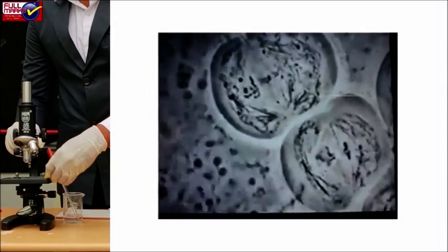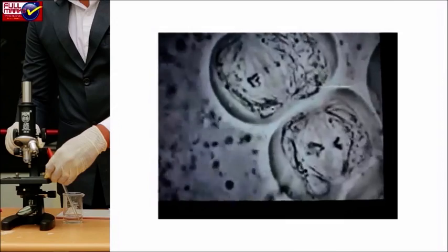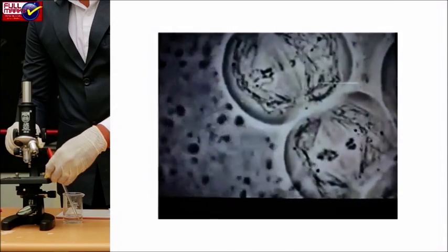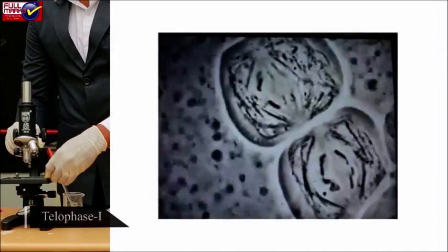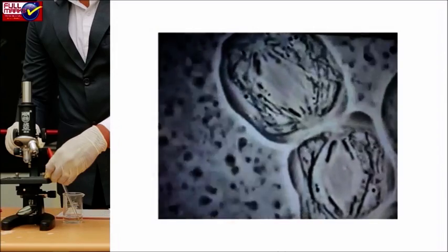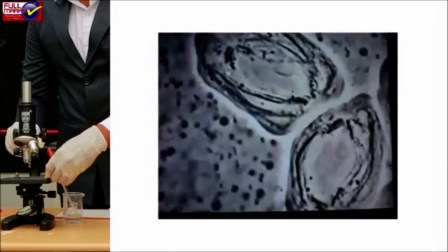Telophase I: The chromosomes may persist for a time in the condensed state. The nucleolus and nuclear membrane may be reconstituted, and cytokinesis may also occur to produce two haploid cells.